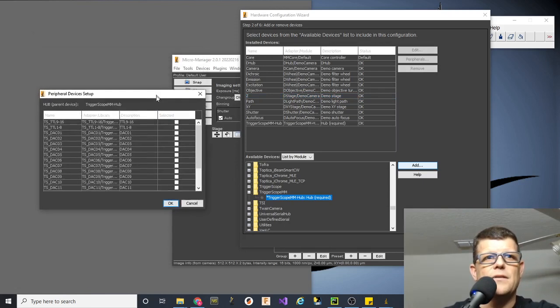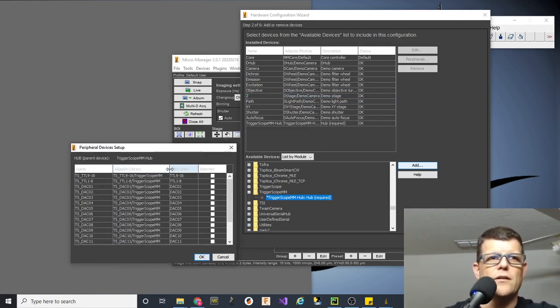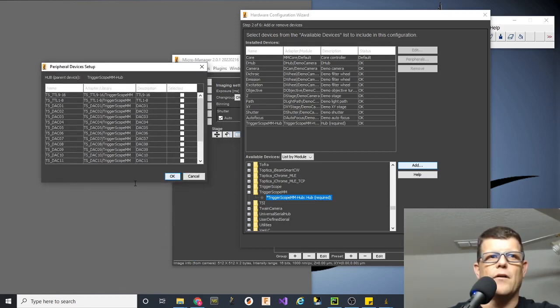Now, the next step, this is an important one. What we're going to do here is we're presented with a whole bunch of options on the right, and then each one of these options is pulled from this adapter library. This is the core, like the hub library.